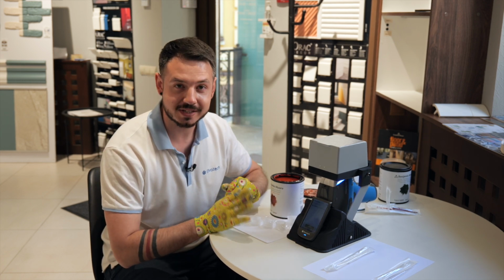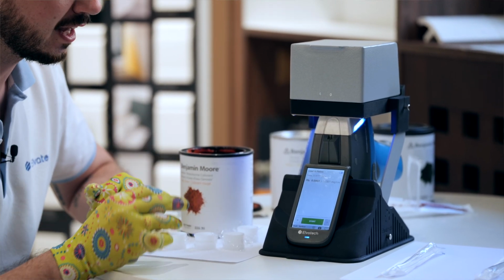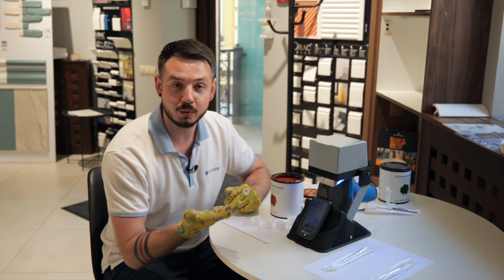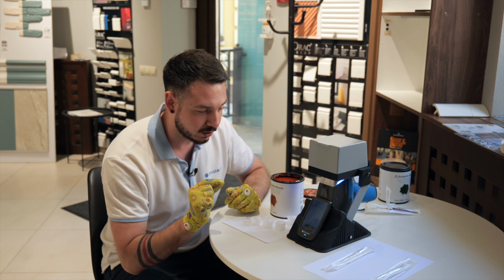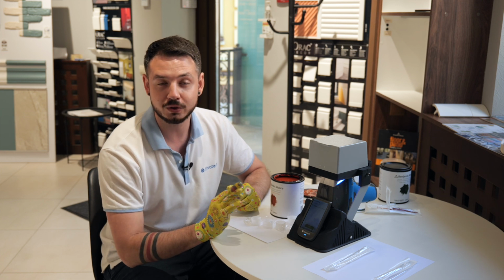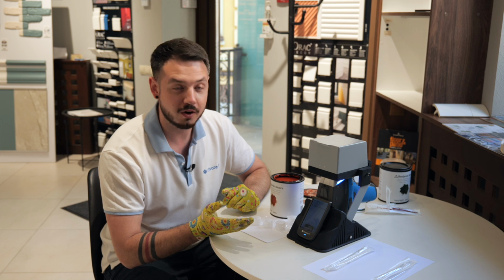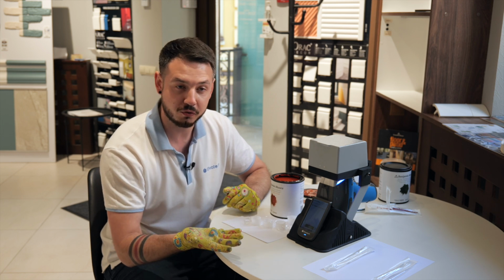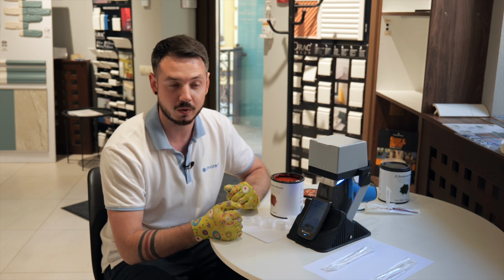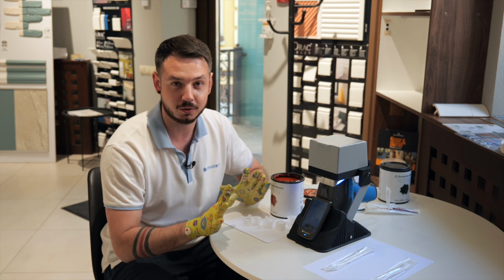Alright, so here we go with the second result. And here the existence of lead in this paint is even smaller. So it goes for 0.0003. And it has just a small error, which means 0.0001. So even if we include the error, our red toner has from 0.0003 to 0.0004. So basically it has the same, and the contamination is even smaller than in the first one. But just to tell you that both paints are absolutely totally cool.